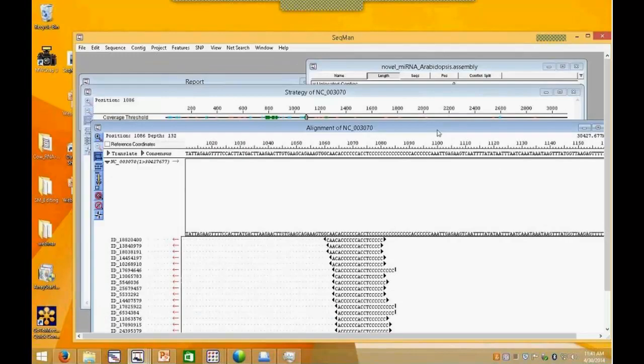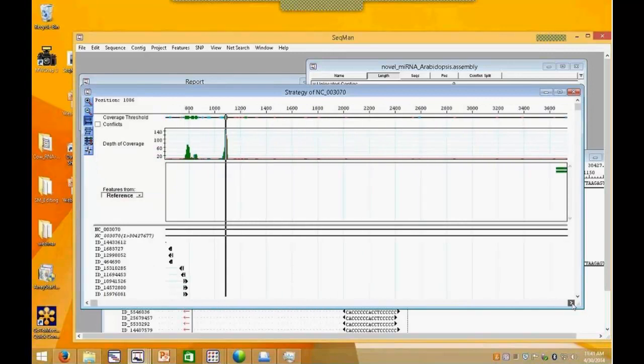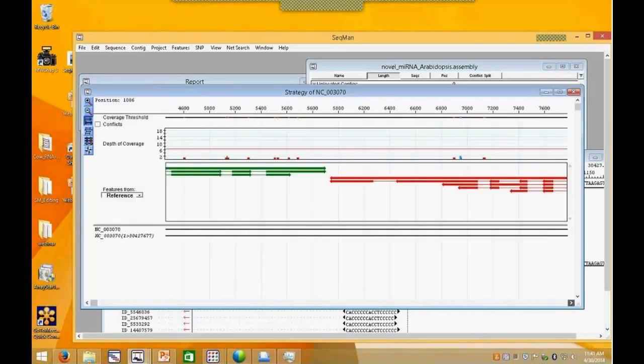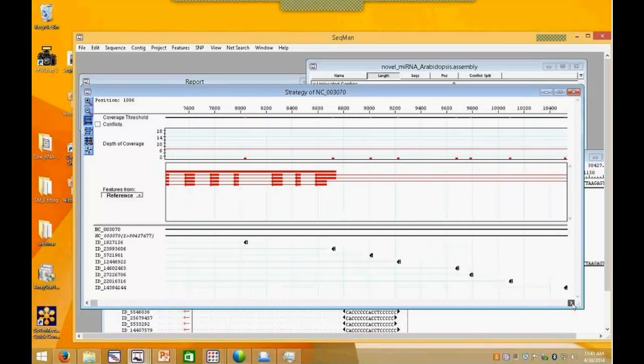So there's different ways to navigate. Usually with microRNA, because these are sparsely located across the genome, these are the peaks. So these might align within genes. It may be upstream or downstream from genes. Many genes aren't going to have any microRNA regulation that's detected.